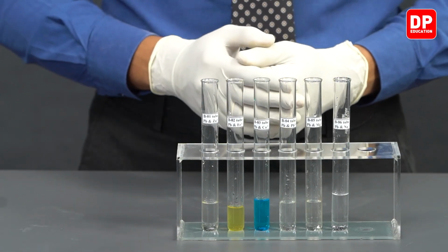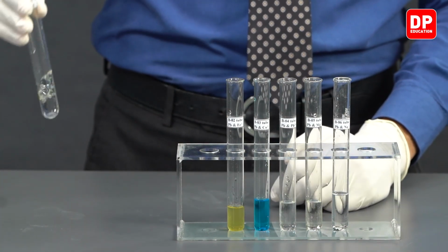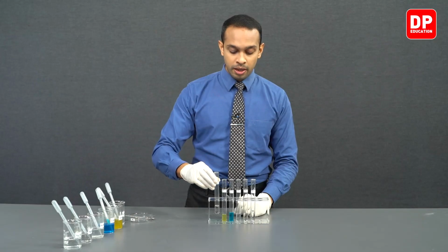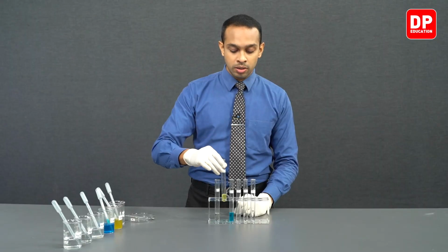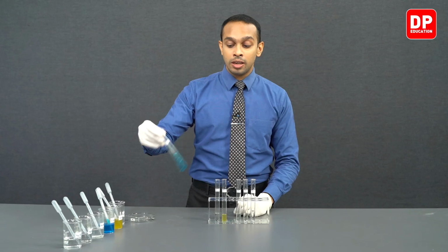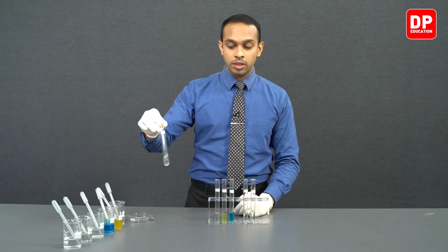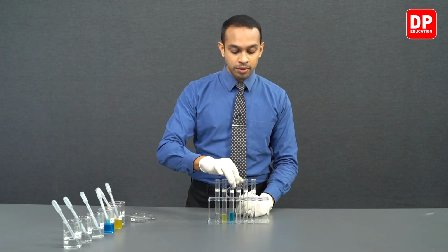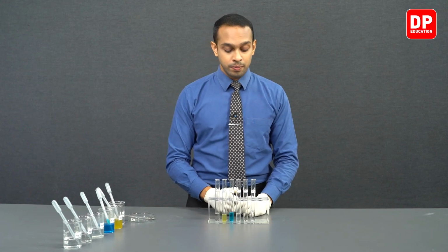Now students, after adding the lead metal pieces into each of these test tubes, we can shake these test tubes a little bit, and then we can allow the reaction to take place for about 10 to 15 minutes in this case, because lead will not react very fast with any of these solutions. So you will have to allow the reaction to take place for a little while longer than recommended.